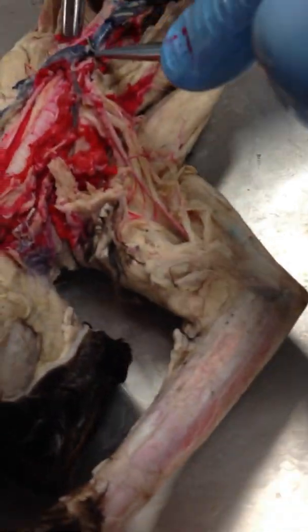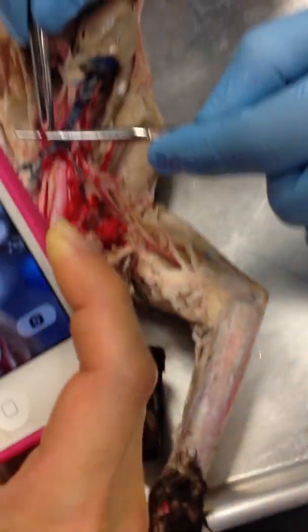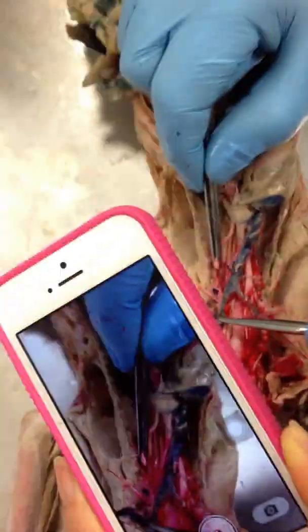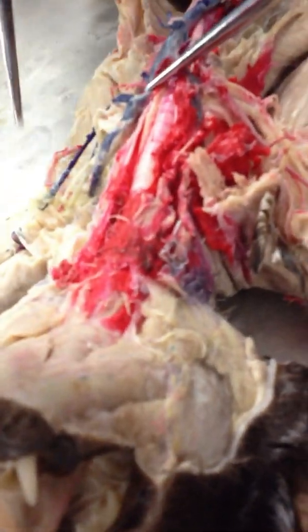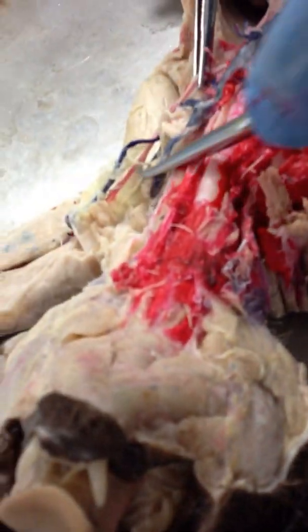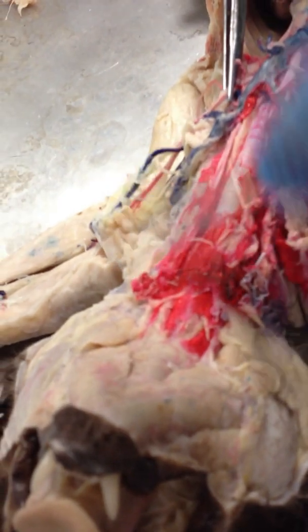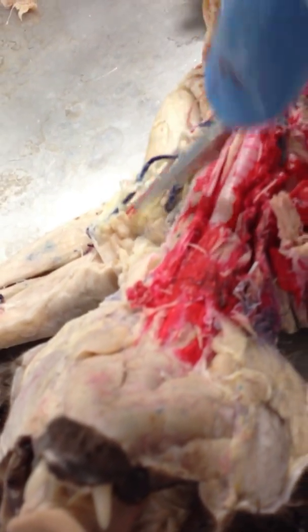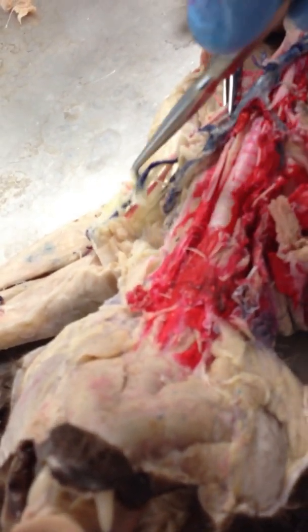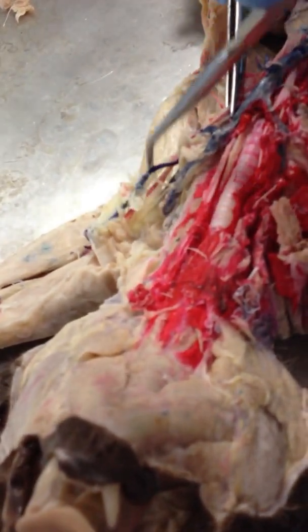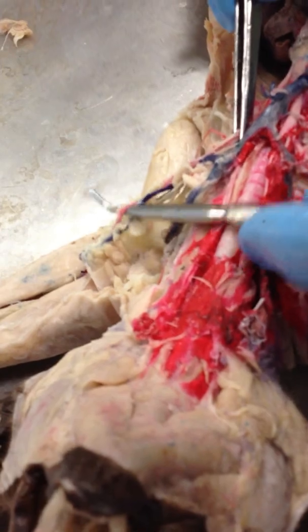Same thing on the left side. The left subclavian is going to be called the left axillary in the axillary region. And then where it continues out across the arm, it's going to be the left brachial artery right there.